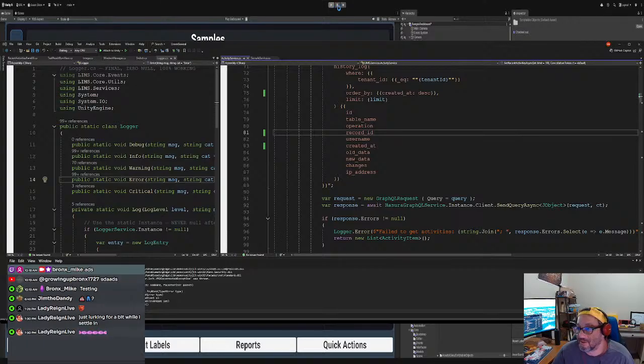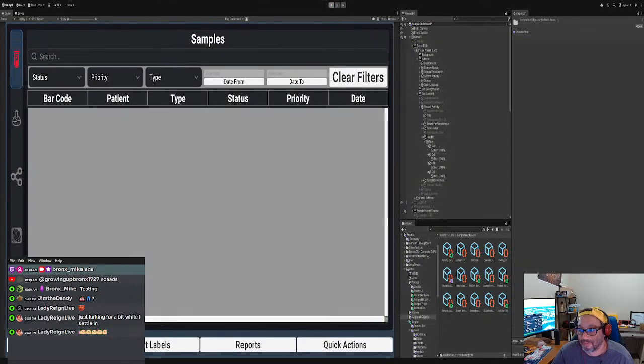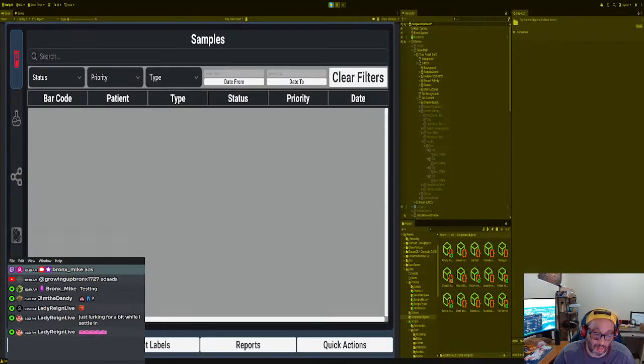We make mistakes like this all the time, so it's nothing new. You just gotta go through it. You know, the more hours you log coding, the more mistakes you make.